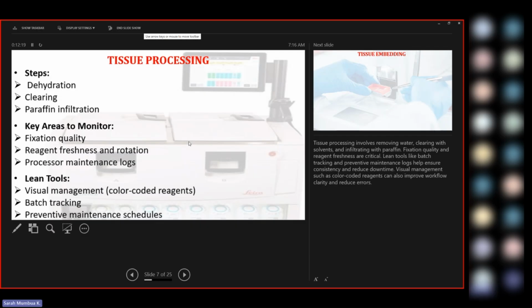So in this step, we are going now to remove water from the tissue, because we want to start our processes. Now the next steps do not mix well with water. So our very first step is dehydration. And in this case, we are using alcohol. When I say alcohol in histopathology, put more emphasis on ethanol. I mean ethanol.